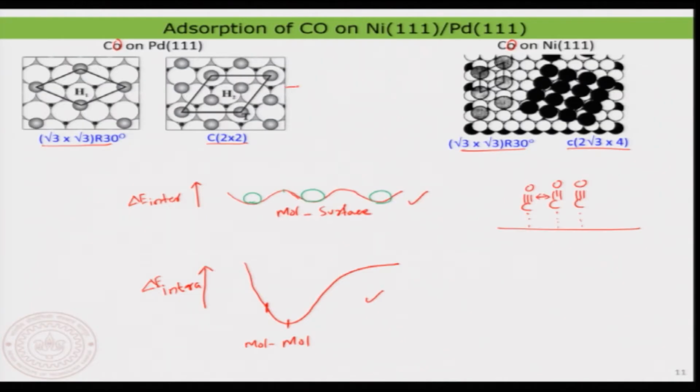So, it is not necessarily the case that you are finally making a thermodynamically stable structure. This is not a thermodynamically stable structure, because you are definitely not letting the atoms occupy the most favorable position. The most favorable positions are indeed these two positions. But you are probably trying to occupy the molecule at this particular position, or this particular position. So, of course, you see that energetically they are not very stable.